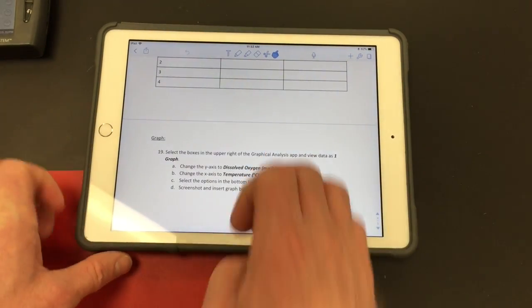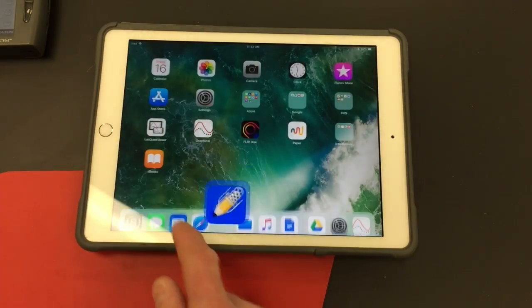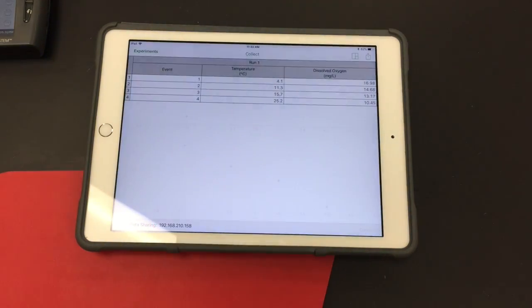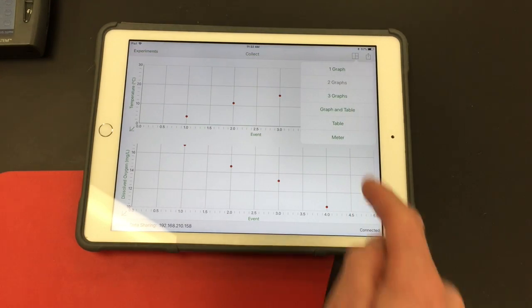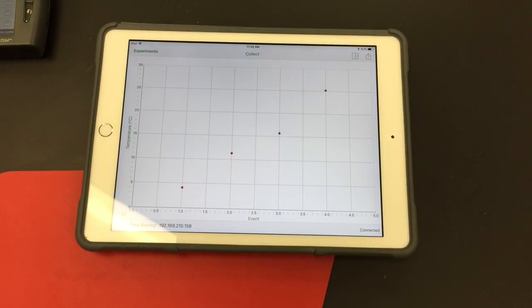And then the second thing I'm going to need to do is generate a graph. And so I'm going to select in the upper right and I'm going to select one graph and I need to manipulate or change the x and y-axis here.